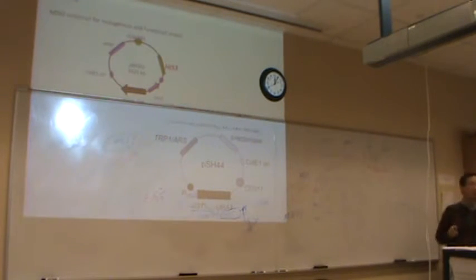The host cell's nuclear genome cannot have histidine, tryptophan, or URA3, otherwise it will not work. Because if the nuclear genome already has a URA3, the cell will be killed as well. And we cannot use the tryptophan marker or the histidine marker. So those genes have to be deleted in the host cell itself for this to work.